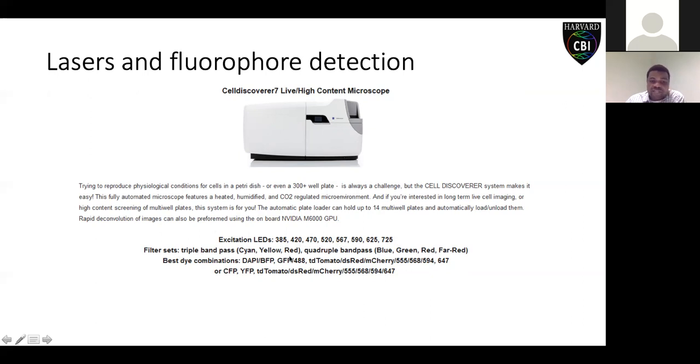Next is the filter set that you have, to be able to remove any excitation light that may come through, or signal resulting from other emission that is being collected from different parts of your sample. For instance, if there is a breakthrough coming from one channel to the other, this set of filters is going to help to separate or remove them.